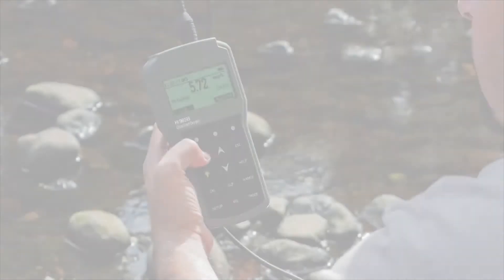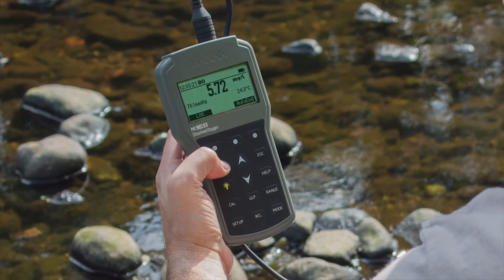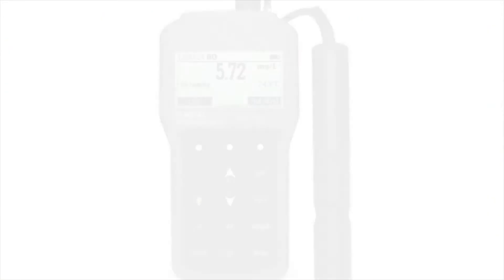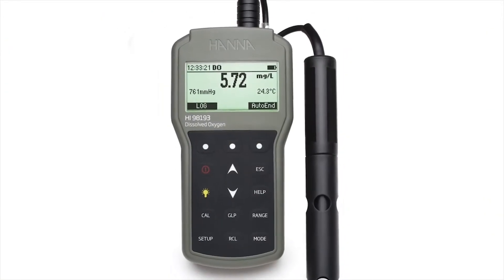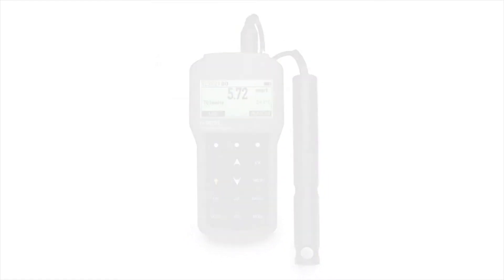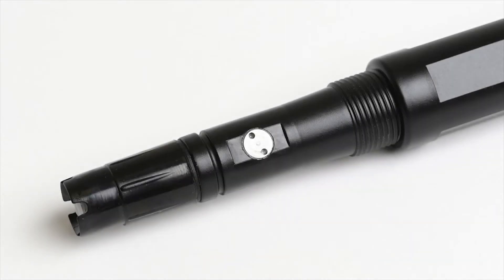Dissolved oxygen measurements are affected by a variety of external factors including temperature, pressure, and salinity. The HI-98193 allows the user to automatically compensate for these external factors, starting with the use of the integrated temperature sensor on the probe.